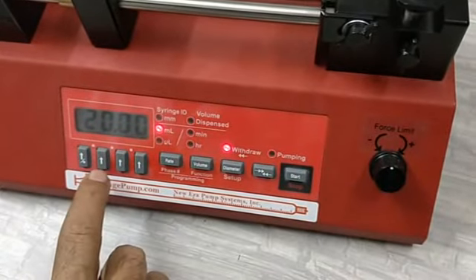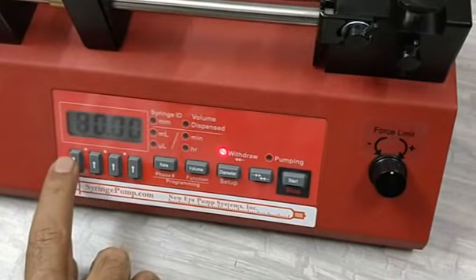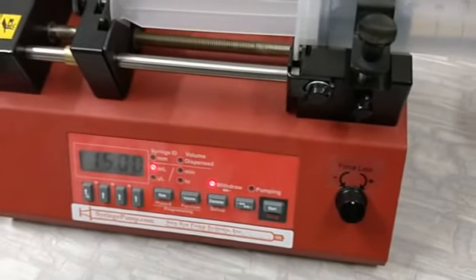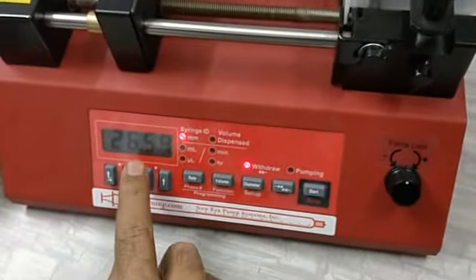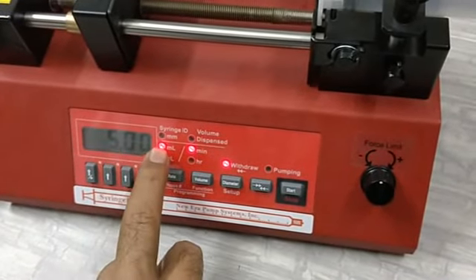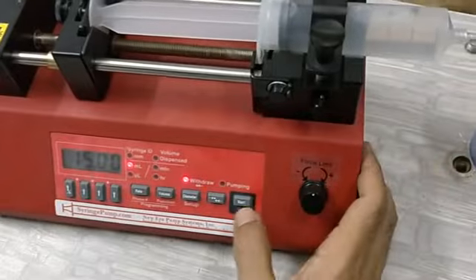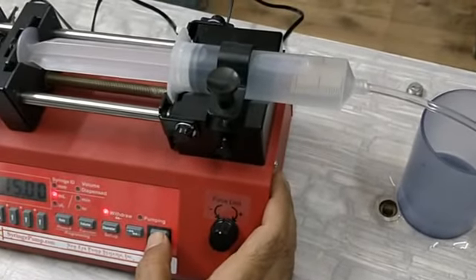Now I will give the volume. Volume is currently 20 ml — let's make it 15 ml by adjusting the digits. So let's review the parameters: diameter is 26.59 mm, rate is 5.00 ml per minute, and volume is 15 ml. Everything is set. I will make sure it is in infusion mode and press start. The pump will now dispense and increase the volume dispensed.